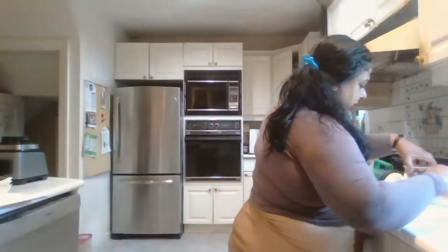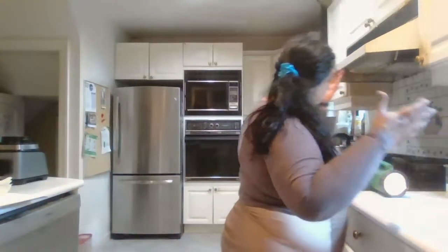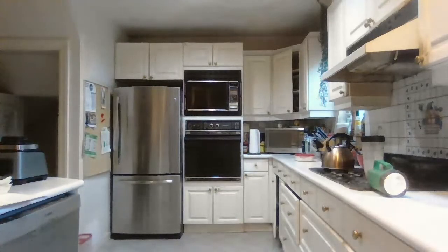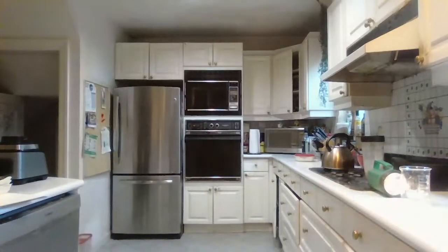And then calibration curve. First, I'll wash this. This is all good oats, actually, but I can't eat it from the beaker. So 200 ml, same. If I get the matching spectrum, then easy. I don't even need a calibration curve. Easy peasy, it's all done. All right, 200 ml.